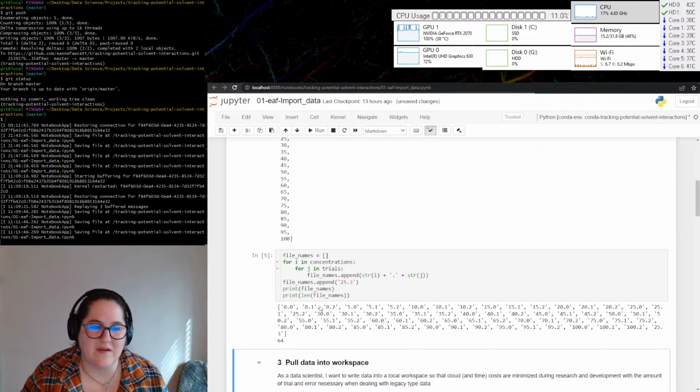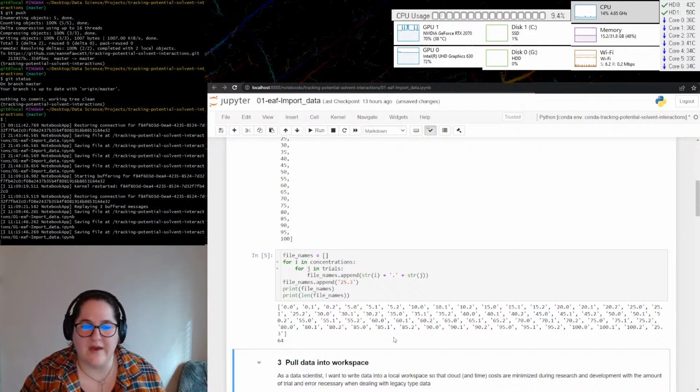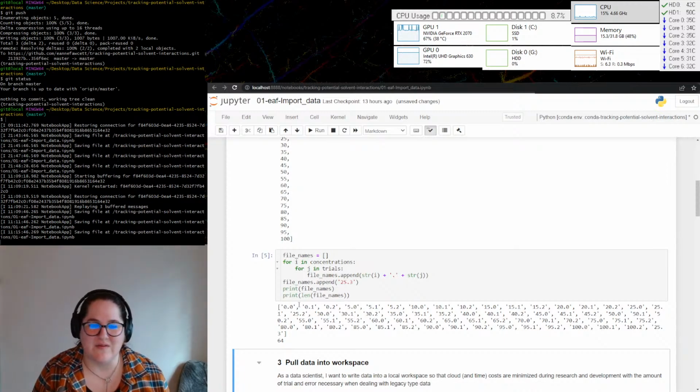And in this particular case, these particular gas chromatograph runs were 7 minutes. So basically that meant I put in my 0 concentration the first trial, and then I waited 7 minutes and then did the next one. During that 7 minutes, I was prepping my samples, making sure everything was in order.